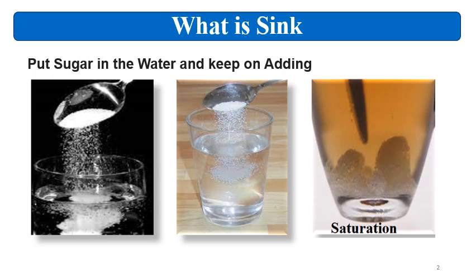See, before understanding the sink condition, consider a simple experiment you might have performed at home. If you take a glass of water and keep on adding sugar into that water and stir it, initially the sugar will dissolve very rapidly, and if you keep on adding sugar, it will take more time to dissolve, and after some time it will start collecting at the bottom and it will not dissolve.